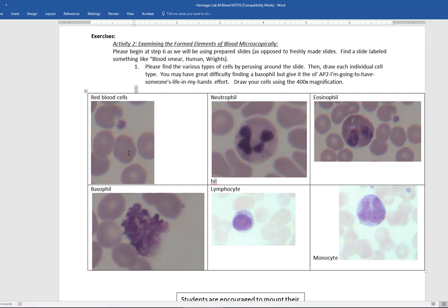We'd look at red blood cells. The important thing to see with red blood cells is I want to be able to compare them to white blood cells in size and color. And so this is a neutrophil again. So neutrophil, multiple lobe nuclei, and again they fight bacteria. And notice they're about the size of 2 red blood cells. Eosinophil, so this is our actual slide, 2 big nuclei. You see those little spots or granules. Eosinophils fight parasites and are involved in inflammation and allergies.